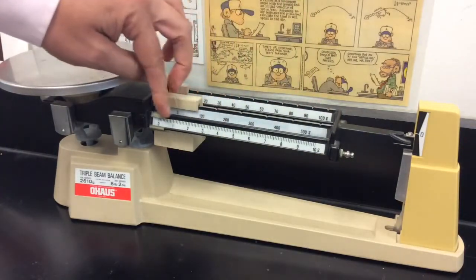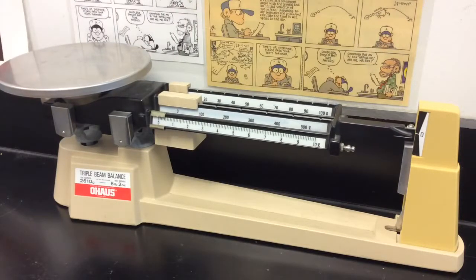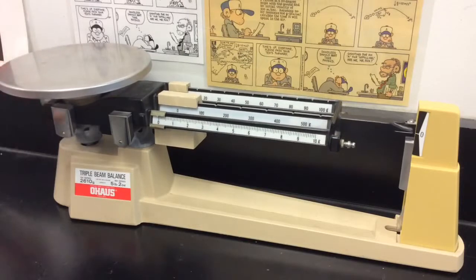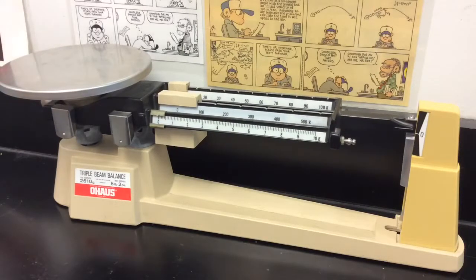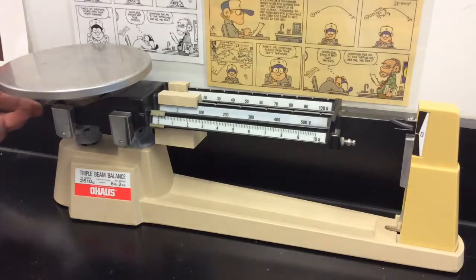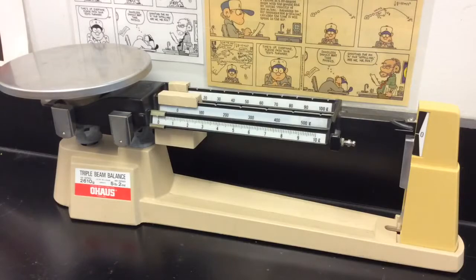Once you get it out, make sure you zero it. Slide all those sliders back to exactly zero, and then on the left-hand side there's a little nut that you can screw or unscrew a little bit to balance the indicator on the right-hand side. You want to make sure that the zero and the little line on the arm are lined up with each other. Screw or unscrew it until you get it pretty much lined up.